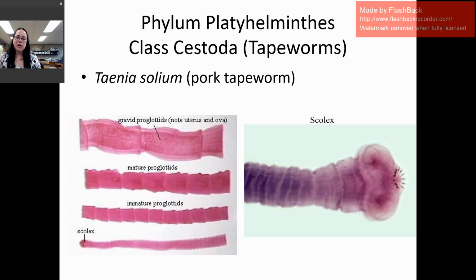Okay, and then after the scolex, you have a neck area, and then you have segments. See, they are a little bit small, and then they become larger and larger, and if you would go way further down the worm, then it would be even larger than that. So those worms can be several meters long, if you're talking feet, even more feet.